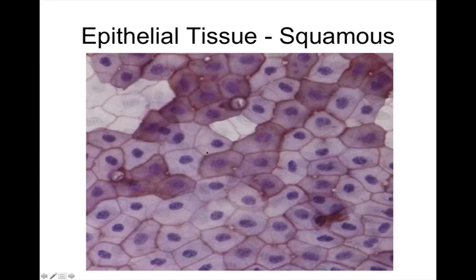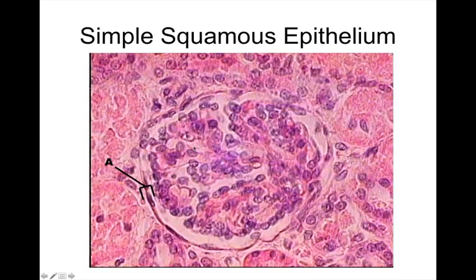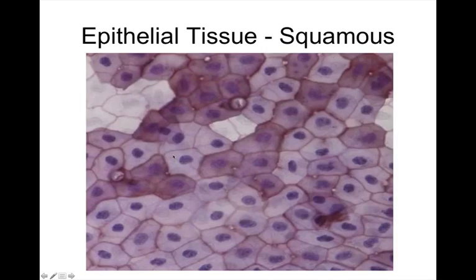Yeah, so each of these, we call it squamous tissue, so you can see each of these individual cells, but not any kind of layering to them. So that's why you're missing a layer part. Okay, so whole mounts we're going to rarely see those.